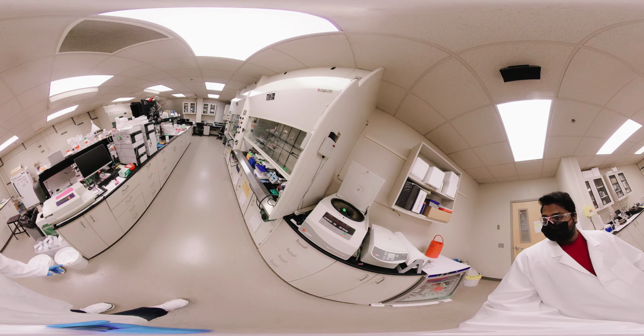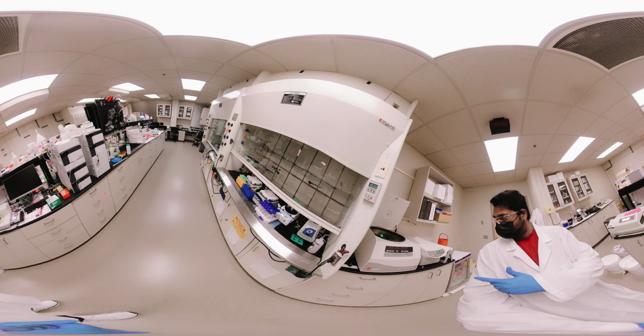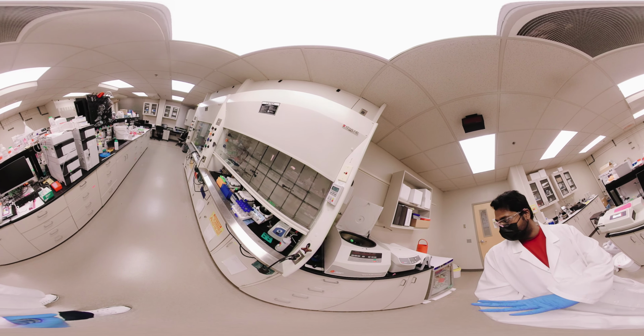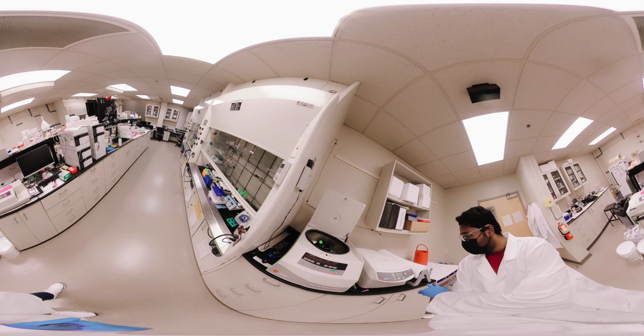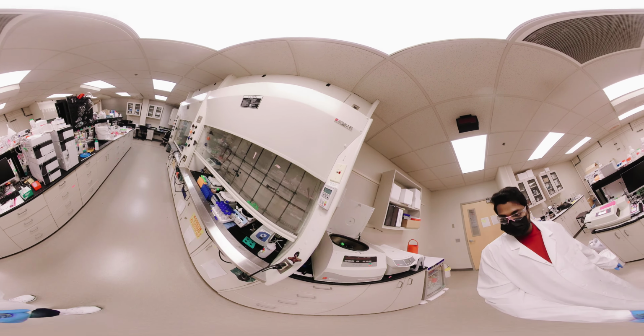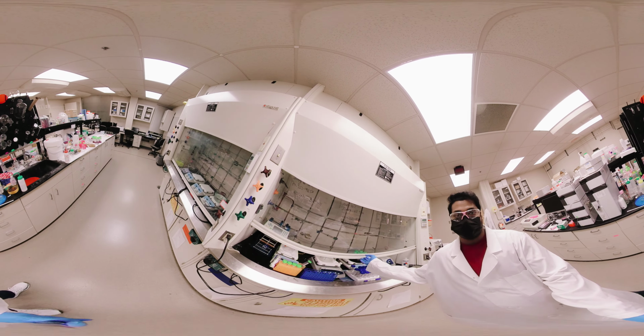This is one piece of equipment we are using, called a centrifuge. We are using the centrifuge heavily. This is the high speed and this is the moderate speed centrifuge. This is the hood section we actually use for our chemical synthesis and everything, and for chemical synthesis you always have to take care.